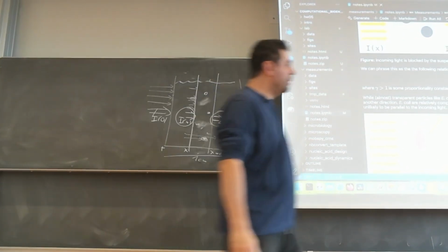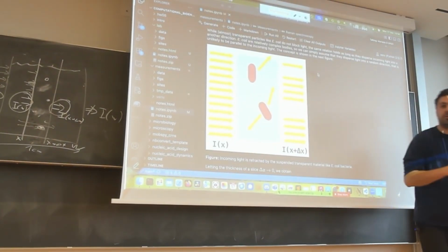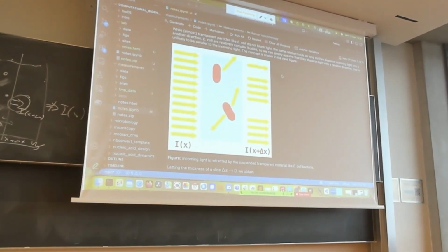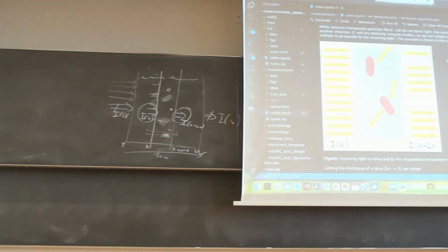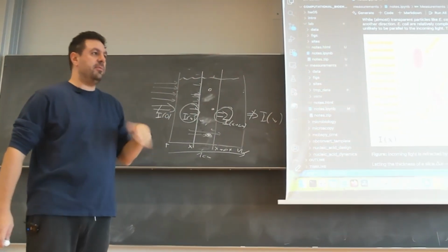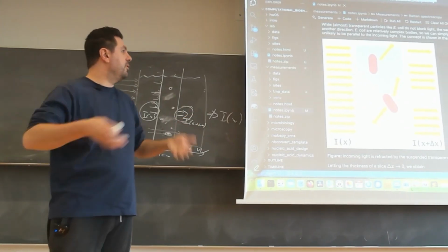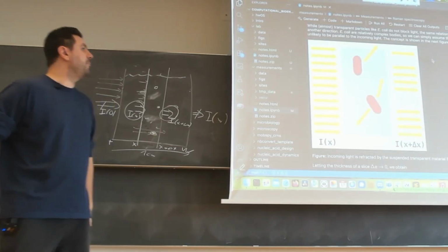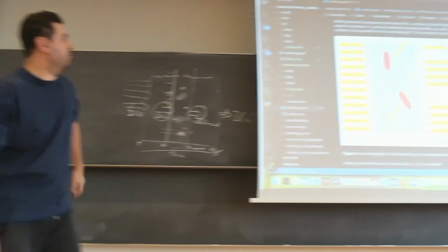And in particular, and this is quite interesting, I think, you can think of something like an E. coli. That will actually not block much light. If you look at an E. coli under the microscope, it's actually quite difficult to find, because it's not something green or pink as I showed it here. That was just for demonstration. It's something very transparent, and you have to use some tricks to see it. So what is it going to do to our light rays?